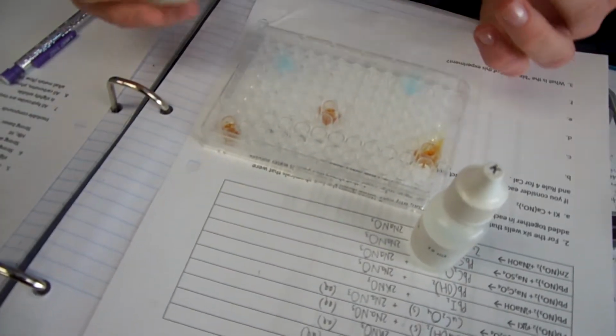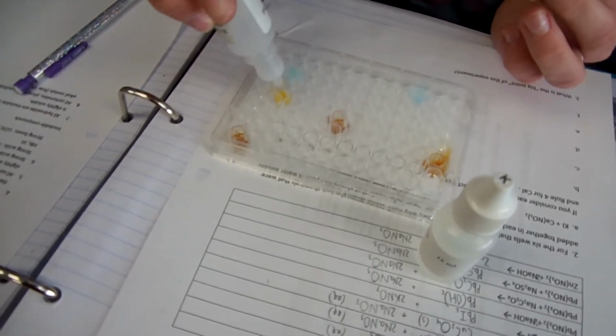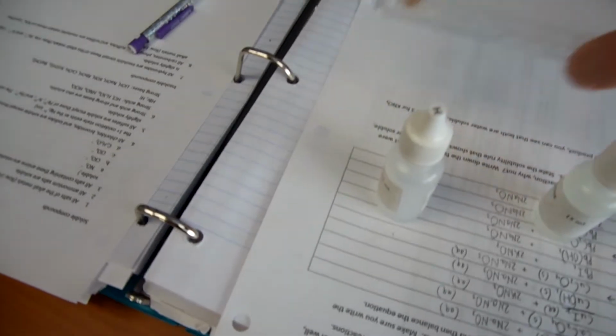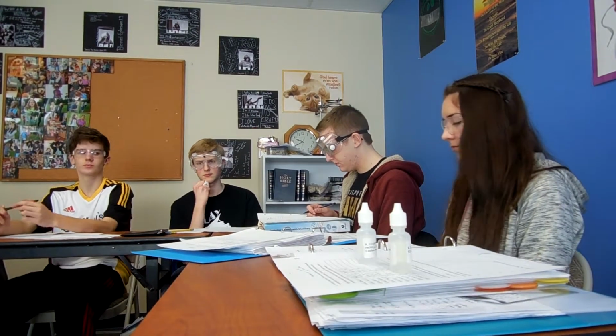That is a very scary looking color though. Whoop, there we are. You don't have to put any more. We definitely got a precipitate there. So we mix two clear colorless liquids. Grace washes hands because that's lead. And we get a beautiful yellow precipitate.